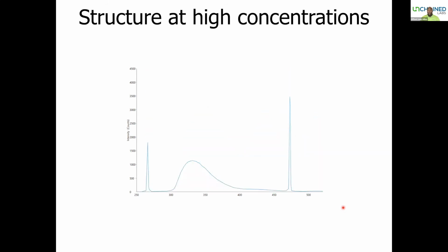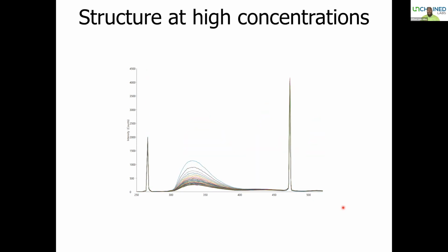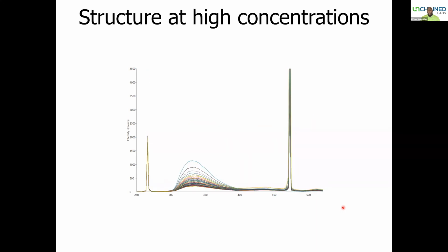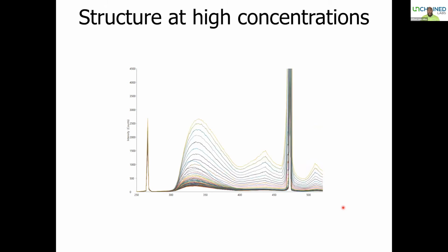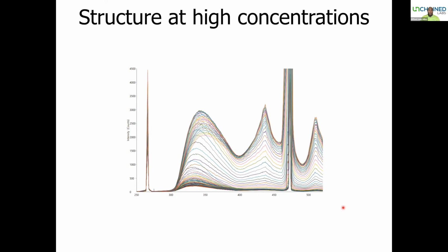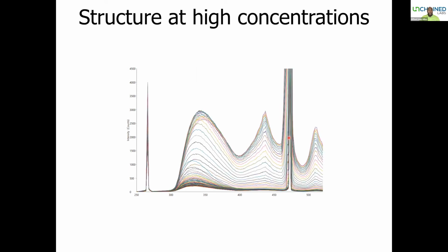And the reason why it's so important is because it gives you an exceptionally remarkable insight into the structure of your sample. In other words, it is not simply that your samples are aggregated, right? They actually are stuck together, and being that close to each other can lead to rather unusual properties. So you and I will often say, well, at high concentrations, I have aggregation. That is actually not true of every sample, right? There are samples which can be formulated at high concentrations. What this allows you to do is to know whether this is happening as a result of concentration or as a result of the properties of your sample itself.